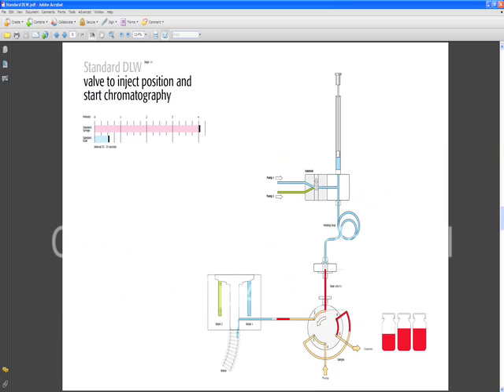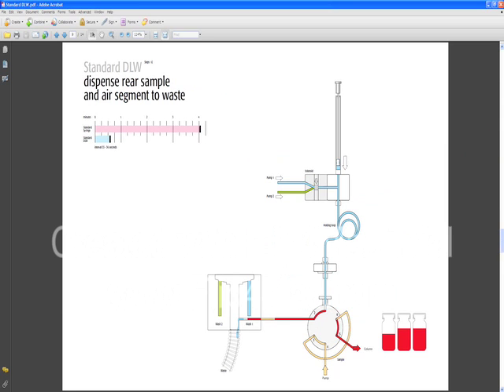The valve turns into the inject position and the sample is now going to be pushed by the gradient pump towards the column. The needle has not retracted out of the valve yet.